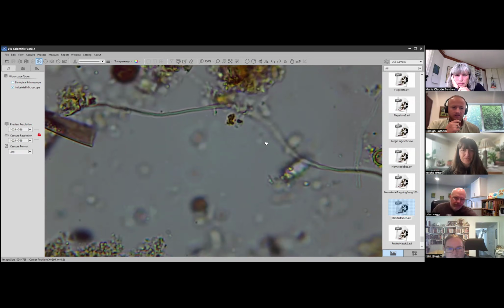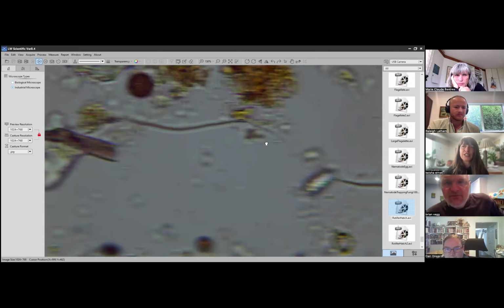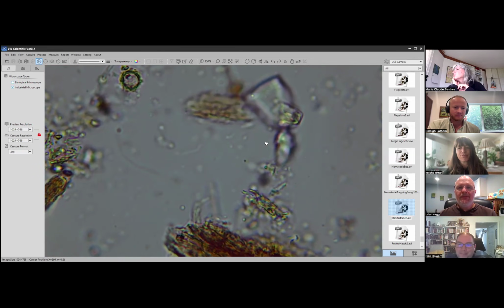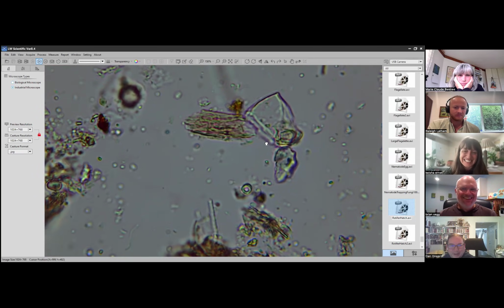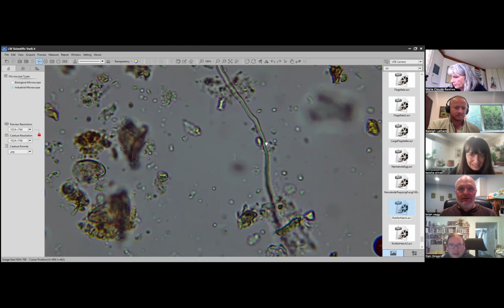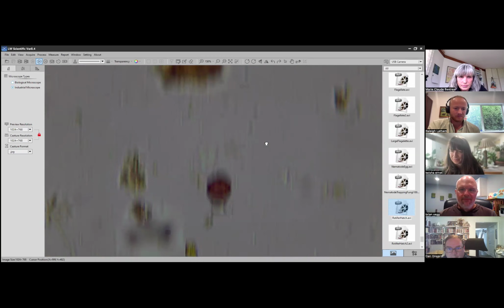Are you using an LW microscope? Yep, it's the Revelation 3. Nice. What camera are you using? It's a Minivid. Nice. I have that microscope too. I'm bringing that to the next session. This looks nice. You've got the mini camera as well, right, Keisha? I do, I just don't ever use it. And that's coming across nice. I love it, this is great. Super clear. So many spores, spores, spores.